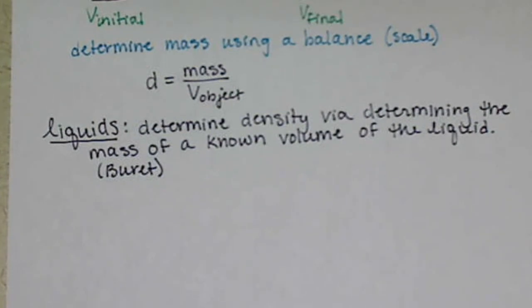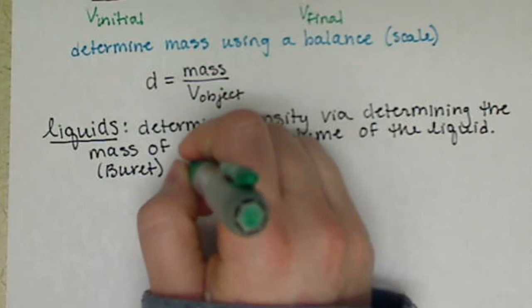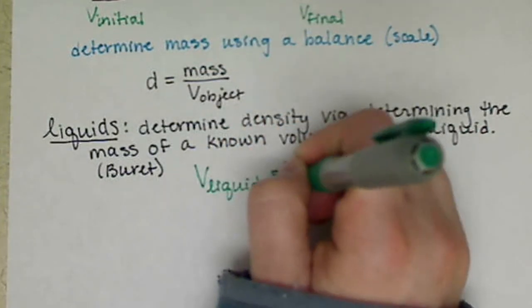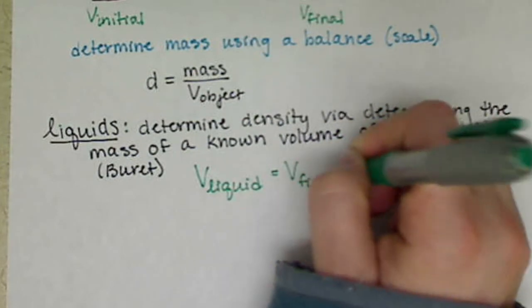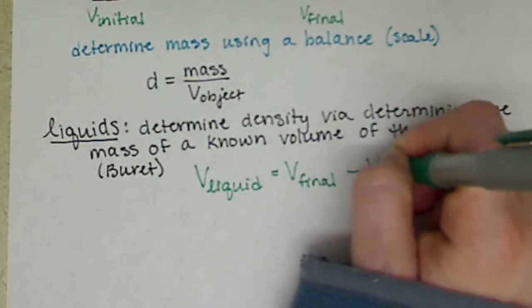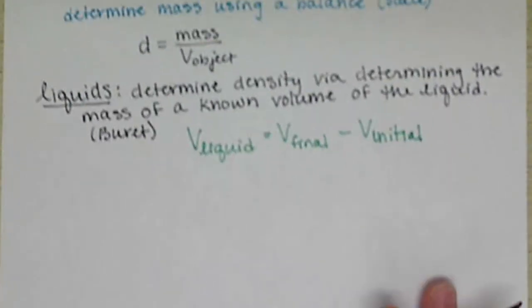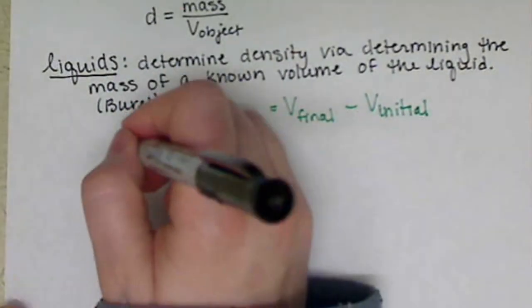So same concept, the volume of our liquid is still going to be the difference in the volume. So volume of our liquid will be the final volume minus the initial volume. We're going to have a slightly different setup for that.